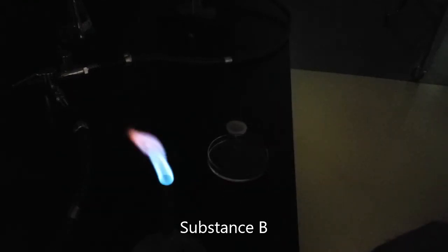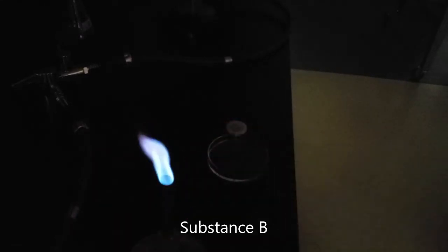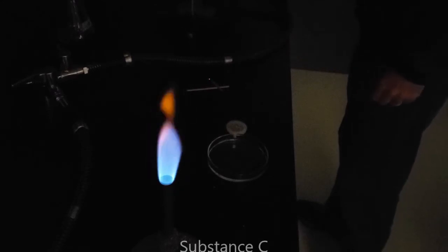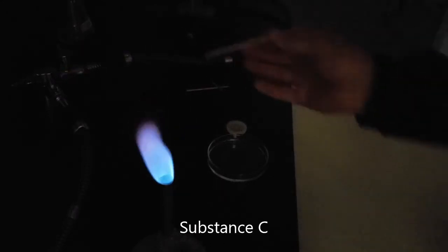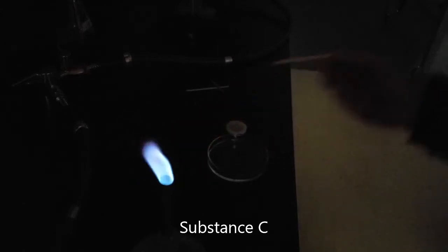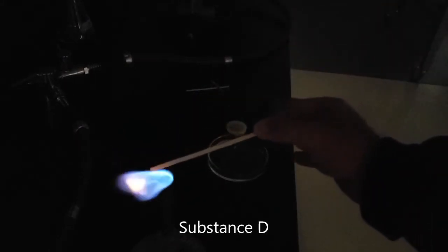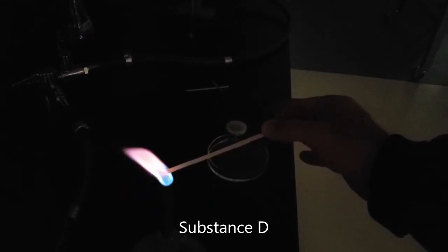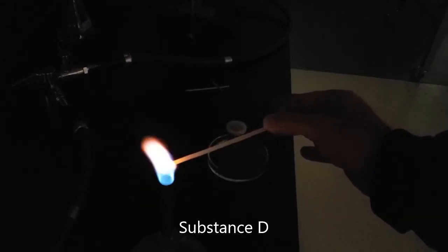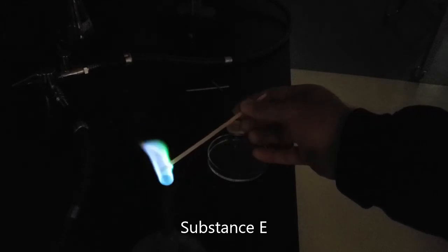All right, so here is substance B's flame test with that brilliant red flame. Here is substance C's flame test. We get that nice green. This is substance D. It's a little hard to tell in the video, but you're looking at a lavender kind of color there, like a light purple. And this is substance E. And we get another brilliant green there.